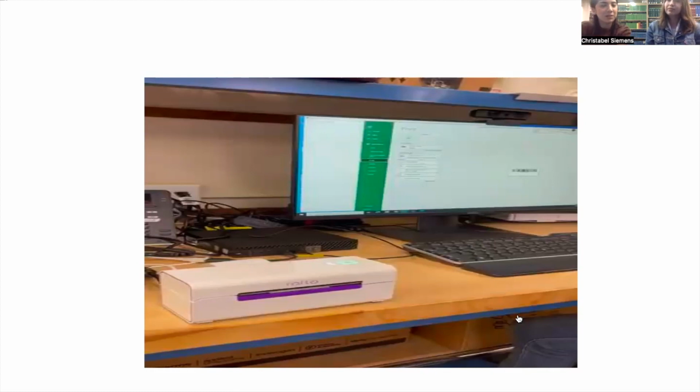And then during this process, we printed just one barcode from each project, but for each project, we are going to have to be printing about, I don't remember if it was anywhere from 6 to 8 or 6 to 10, just because each soil sample starts off from one big bag and is then transferred over to other bags depending on their aggregate size. Yeah, the aggregate size, and then put into vials and tubes for each test. And so each of those vials and tubes are also going to need their own barcode.